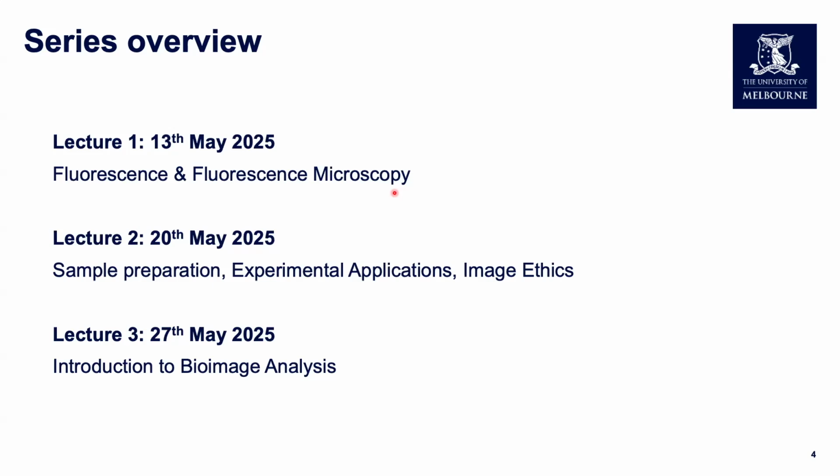So lecture 1 covered fluorescence and fluorescence microscopy. Today we're going to focus on sample preparation, spend quite a bit of time on different experimental applications that you can do using fluorescence microscopy, and cover a little bit on image ethics. And next week, my colleague Ellie Cho will be giving the Introduction to Bioimage Analysis webinar.